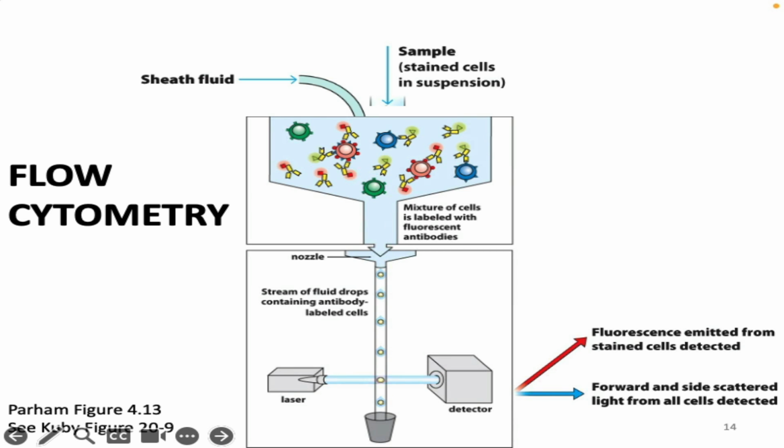And so here is a little bit of info about the flow cytometer. I'm going to explain it, and then I'm going to show you a little video that talks through it. So what we do is we first take our cells and do some pipetting with them. We prepare the cells. So up here you've got your sample, which is your cells that you've prepared.